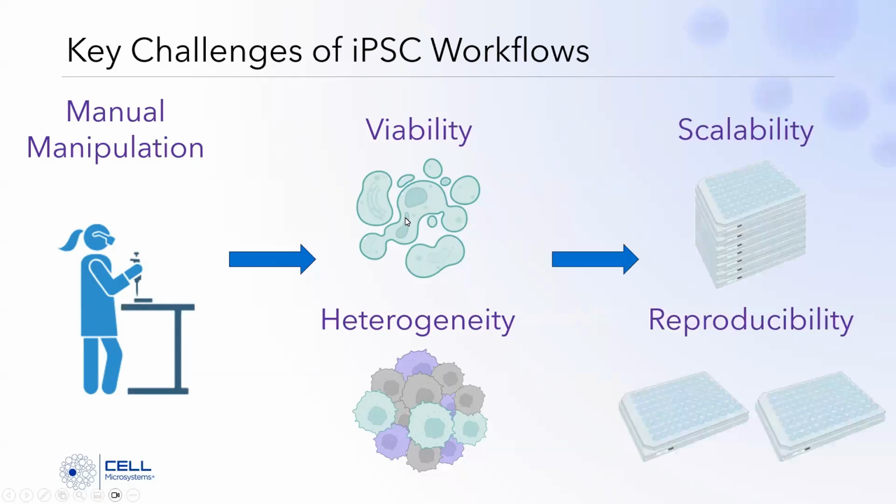And because of these issues, manual manipulation, heterogeneity of your population, a high degree of cell death, this has limited the availability of these types of cells in scalable or reproducible workflows, whether it's assay development or scaled for therapeutic production.